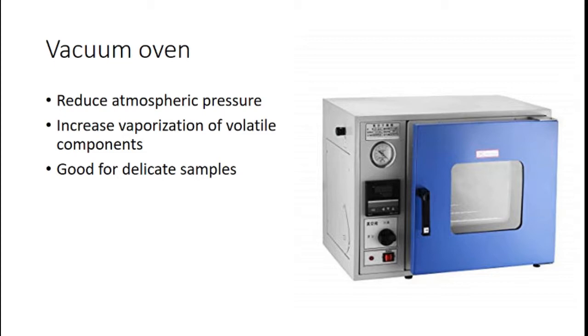Well, in the case of testing for moisture content in certain functional ingredients or additives or vaccines or chemicals used for animal health, they'll be using a vacuum oven because it's going to be less destructive to some of the biological chemicals in those samples.